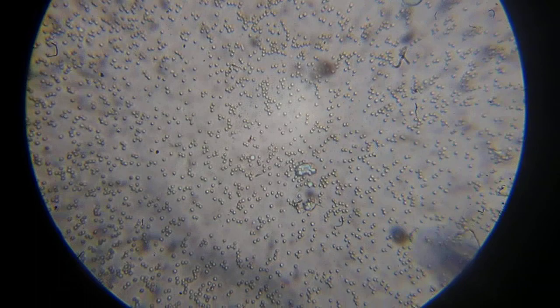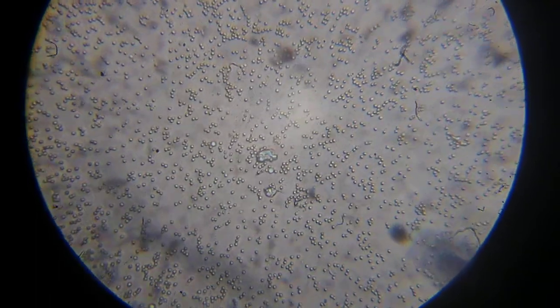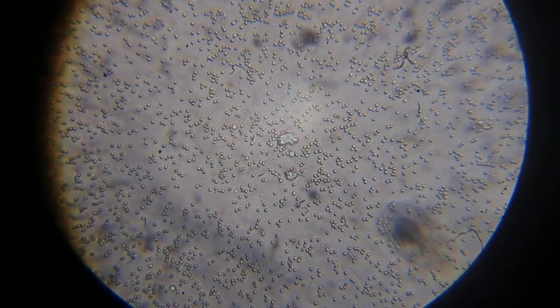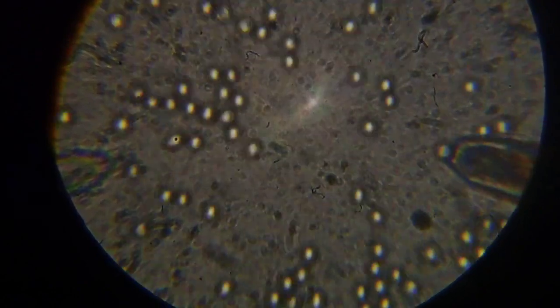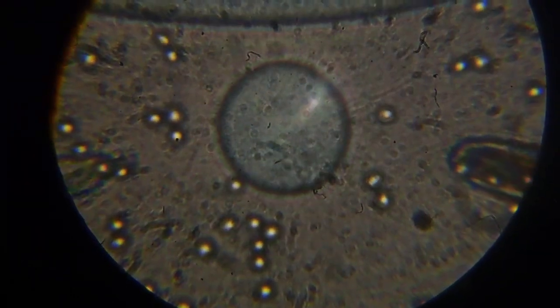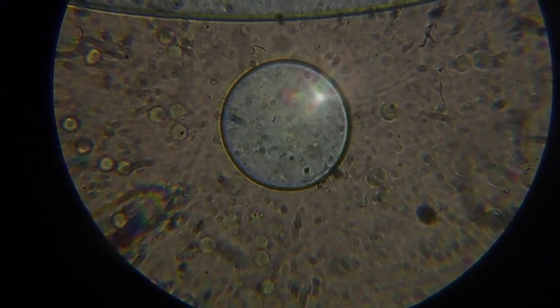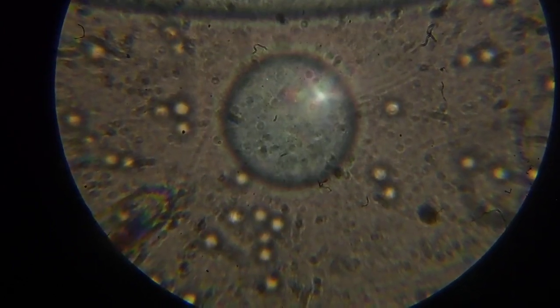I think we find a candidate. Okay. Yep, I'm very certain that's a neo. Happily coexist with the blood cells.